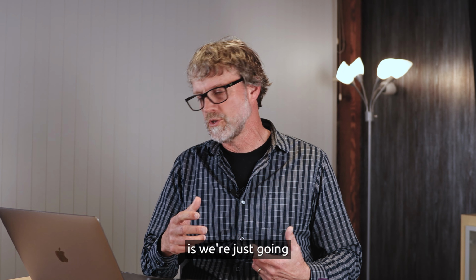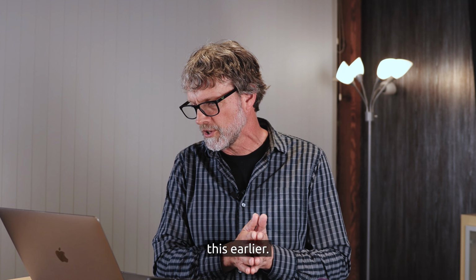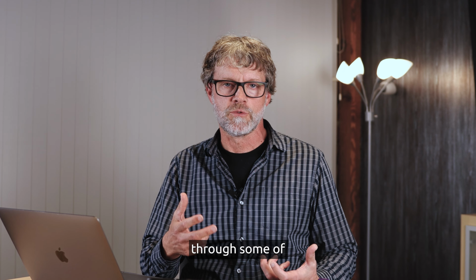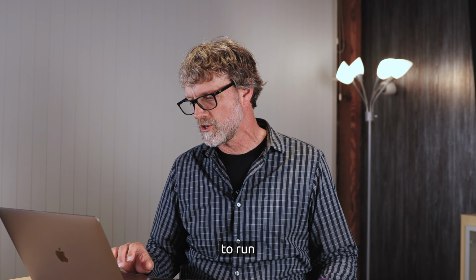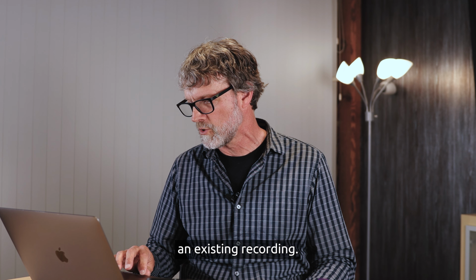So what we're going to do is run some vials through, and I created a recording of this earlier. I'm going to show what it looks like to pass vials through. Some of these vials are compliant, some have defects on them, and you'll be able to see what it looks like to run a batch of vials through Avis using an existing recording.